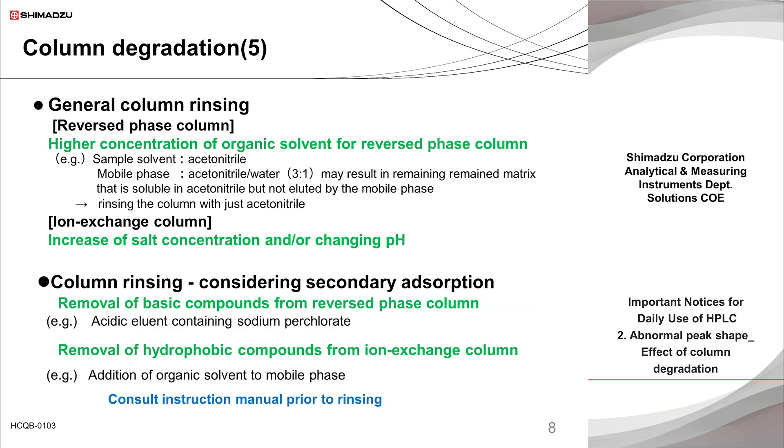As shown here, there are two possible examples for column cleaning. One is to use a mobile phase with a significant diluting power to remove compounds that are strongly retained in the column. The other one is to utilize a secondary interaction to remove compounds adsorbed on the packing material.